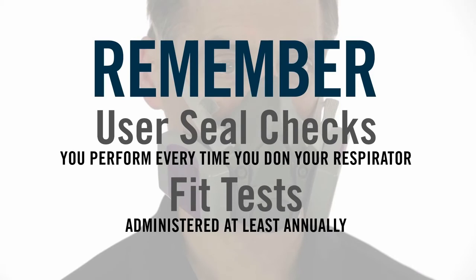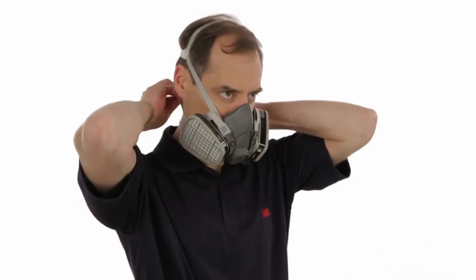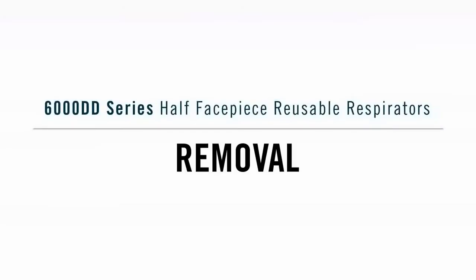Remember, a user seal check is not a substitute for a fit test. It is very important that you are fit tested annually to be sure the respirator is capable of fitting you properly. Removal, 6000. To remove the respirator, unhook the lower straps using both hands and pull the head harness over your head. Removal, 6000 DD.